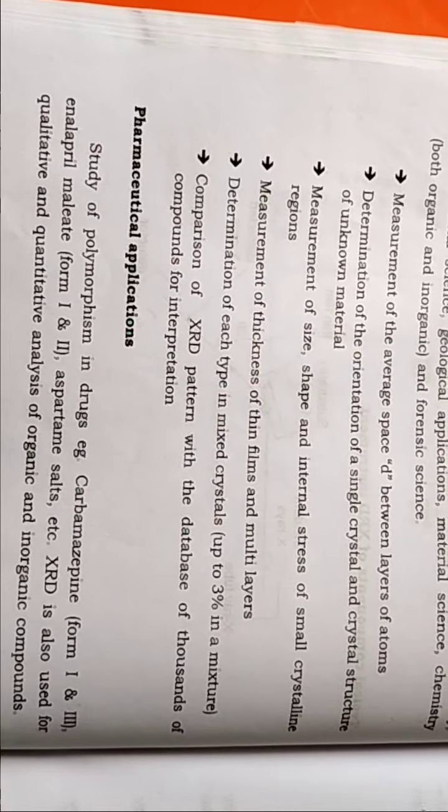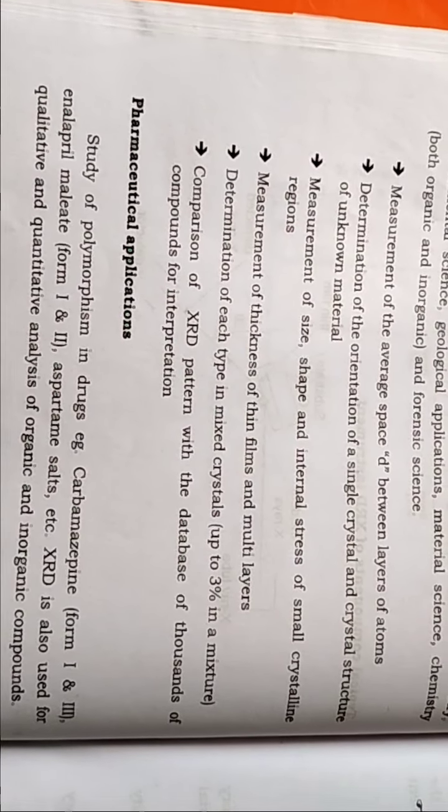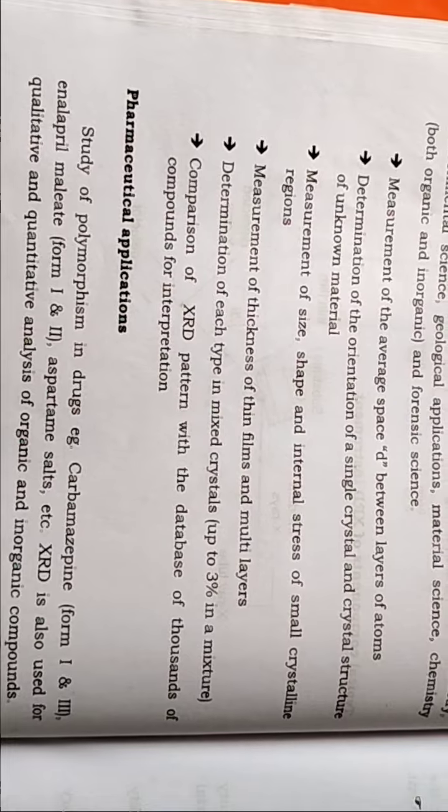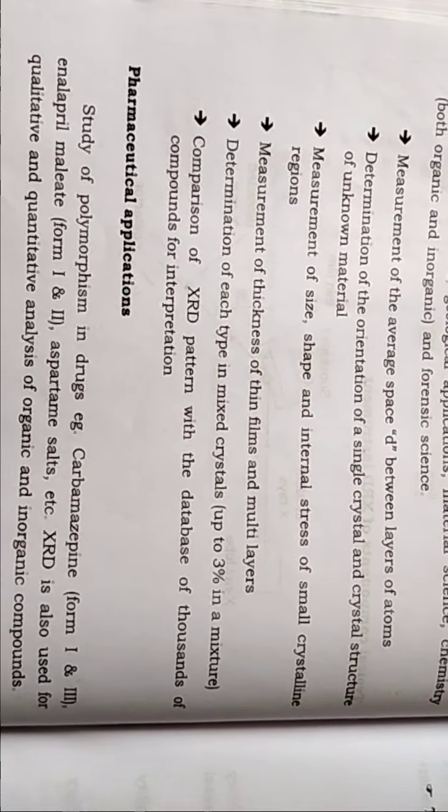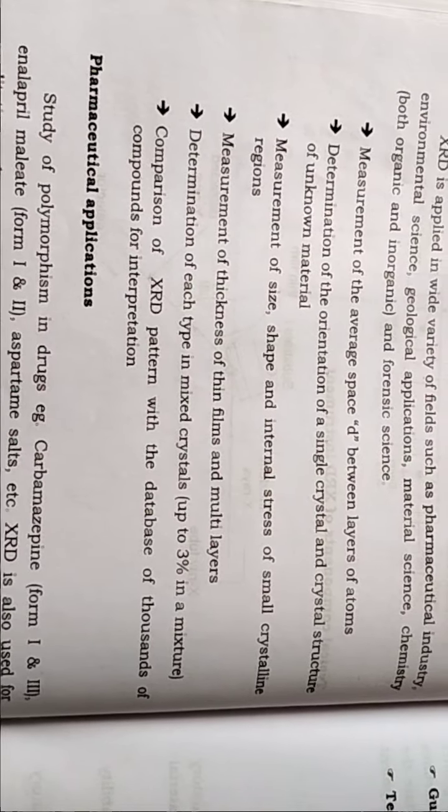Here we can see drug examples: carbamazepine and enalapril are analyzed using XRD diffraction. Thank you.